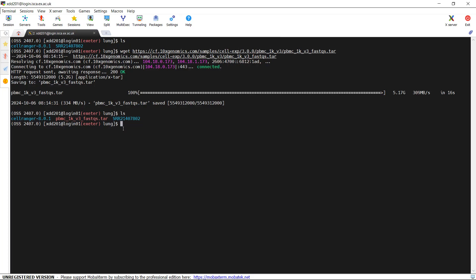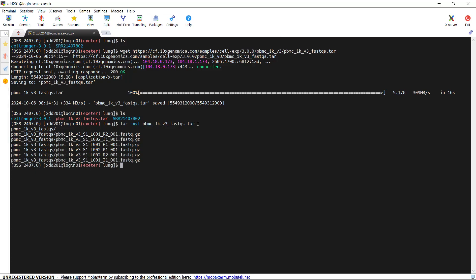We need to extract the sequencing data from the tar file, so let's use the tar function. You can see the computer is extracting the data — it is done. You can see from the file names there are R2 and R1, meaning the sequencing data has two reads. We now have a folder named pbmc1kv3_fastqs containing six files. We can remove the tar file.